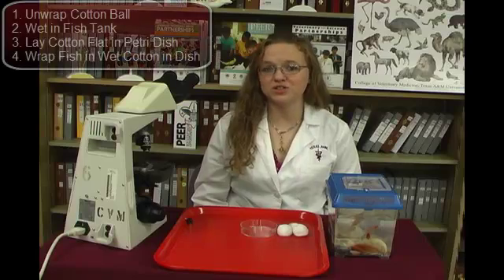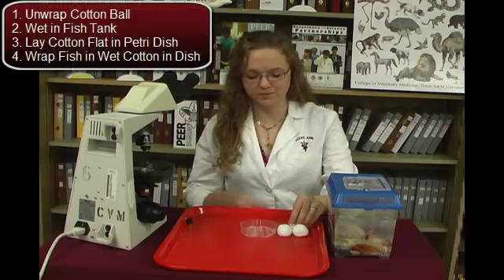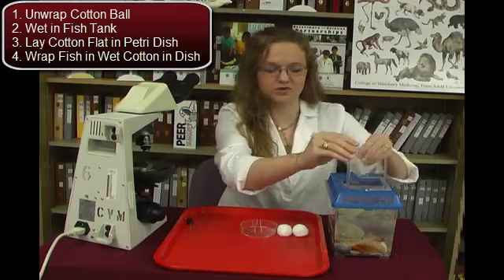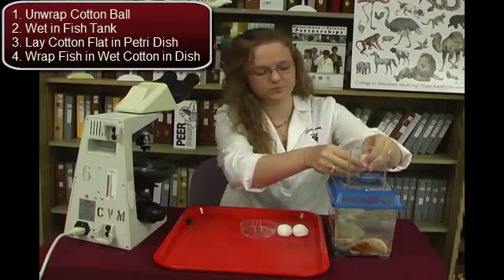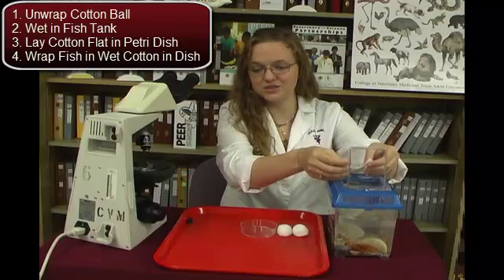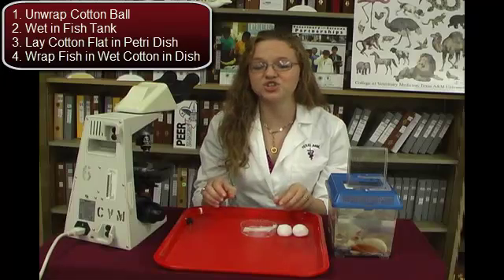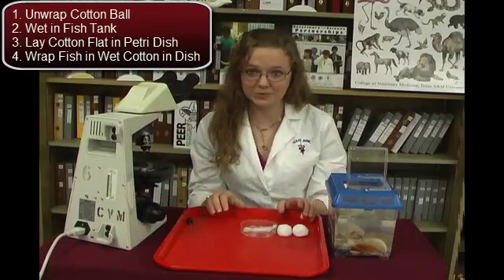To begin this activity, we will first start by unwrapping a cotton ball. We unroll it into a flat sheet and then wet it in the water from the fish bowl. While the cotton is still wet, we lay it flat in the petri dish so that we can now add a fish to the petri dish.